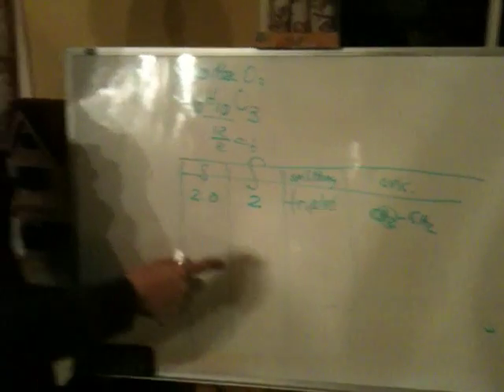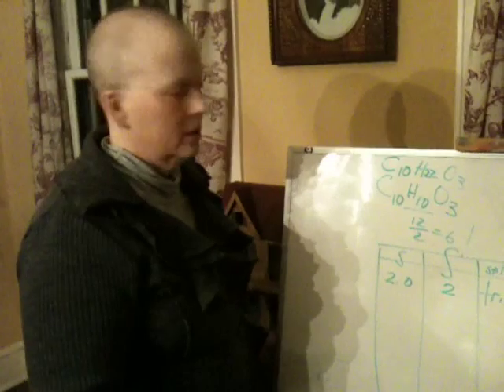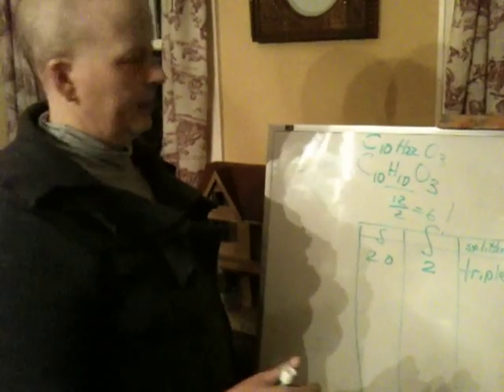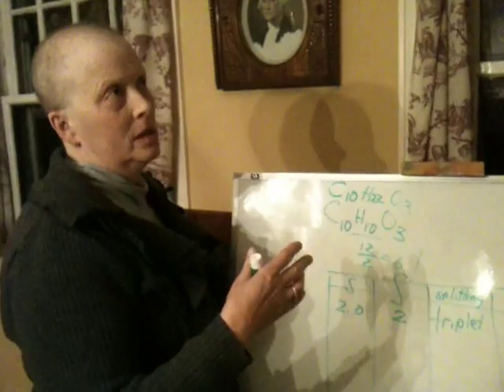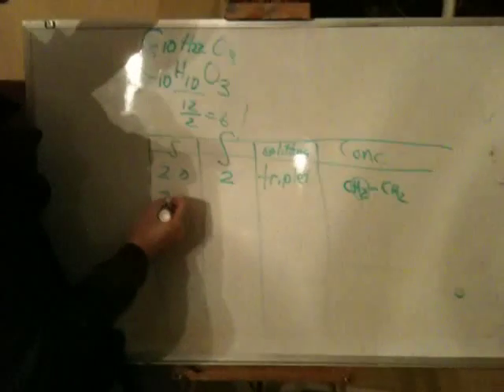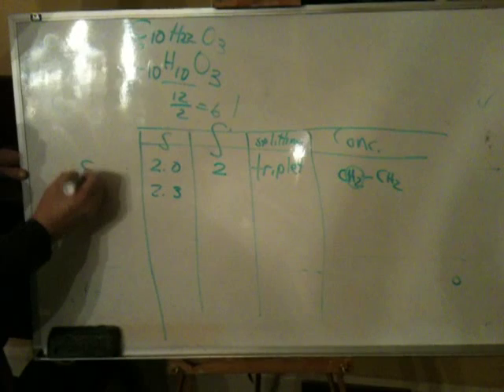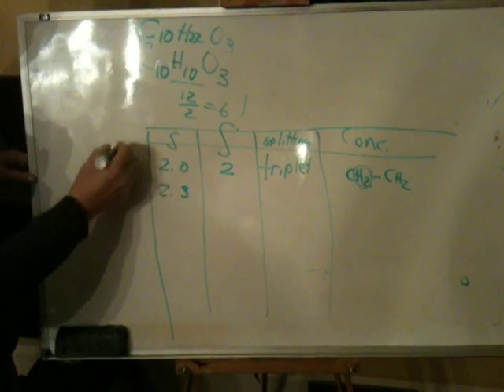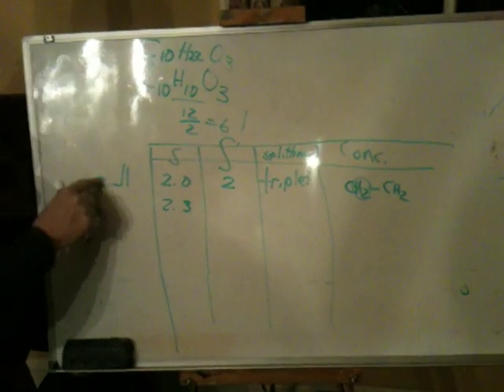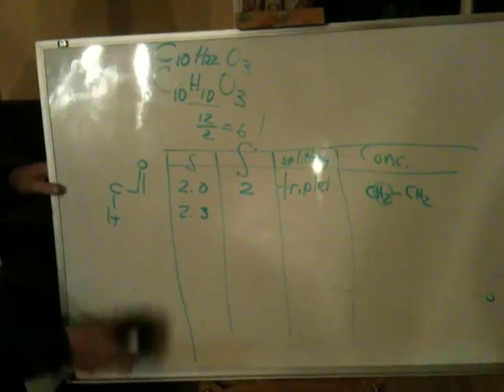This position, by the way, is consistent with being near a double bond of some kind. Not on a double bond, but near one. This does not indicate a particular functional group as of yet. Then a little farther down, these shifts are consistent with this kind of situation, where you have an H on a C next to a double bond, and that could be a double bond O too. We saw that a little bit in class today.